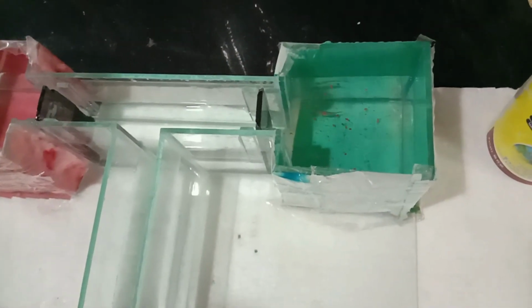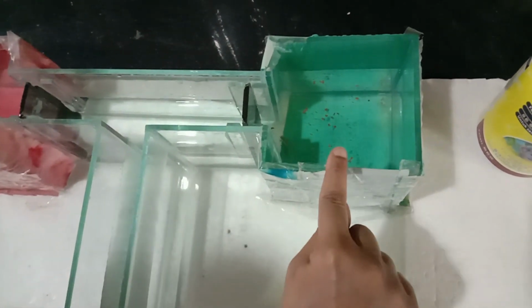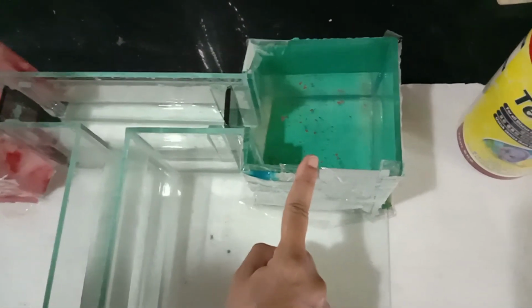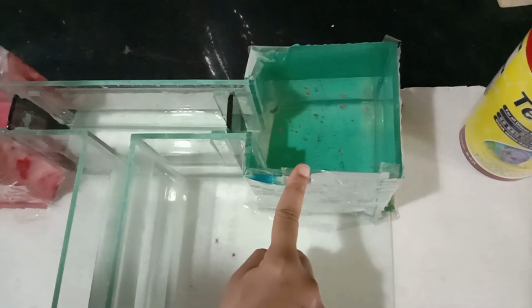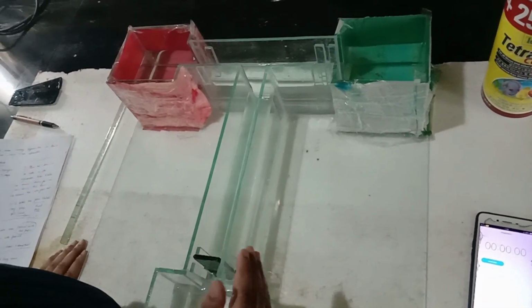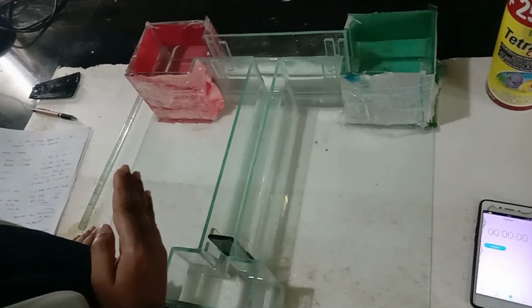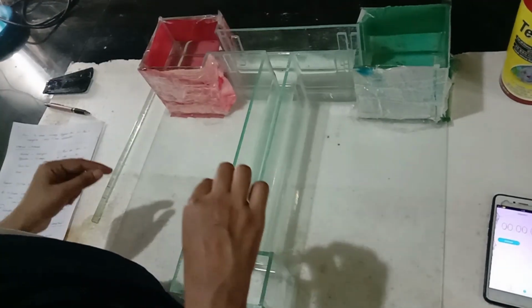After completion of 5 minutes, now we allow the zebrafish to enter the favorable zone. In the favorable zone, either we do not disturb the zebrafish or we provide feed to the zebrafish, and we allow the zebrafish to remain there for 5 minutes. In this way we give 3 trials per day and a total of 4 days were chosen. Out of 4 days, 3 days are given for training and on the final day all gates are open.